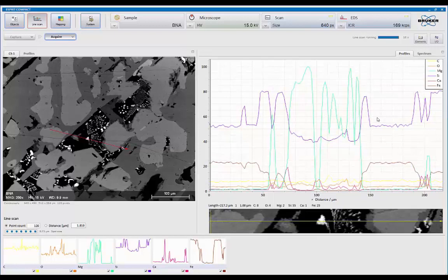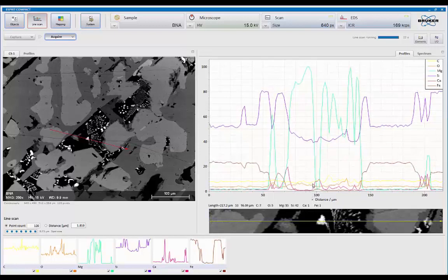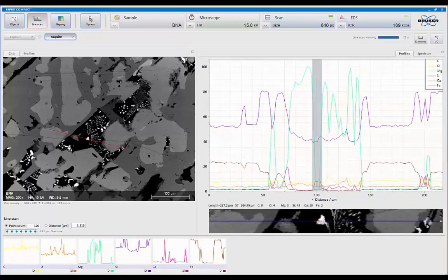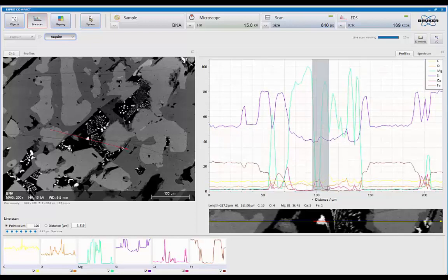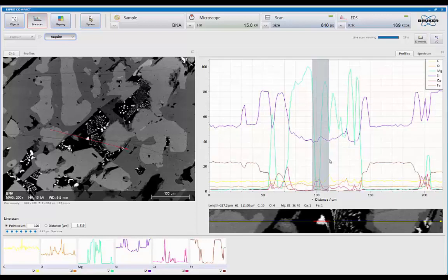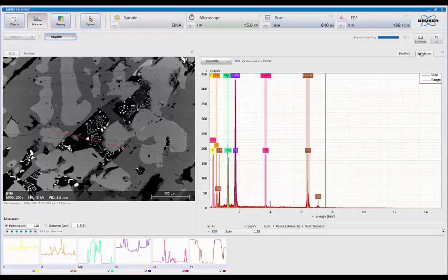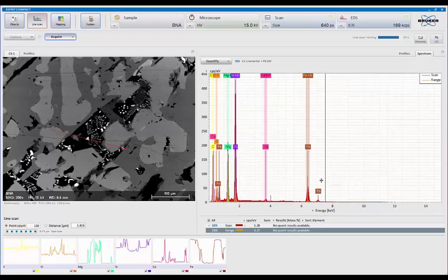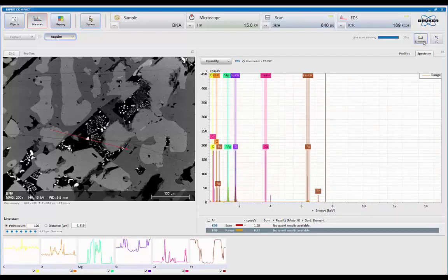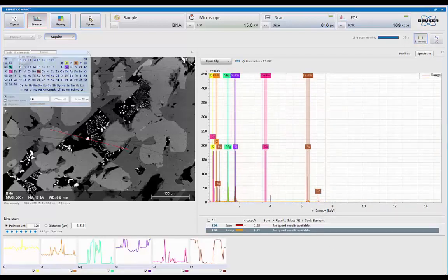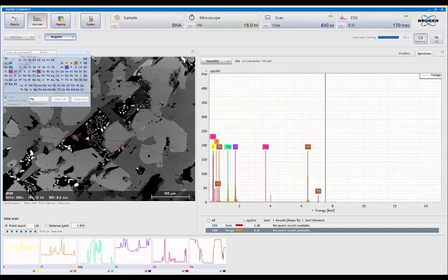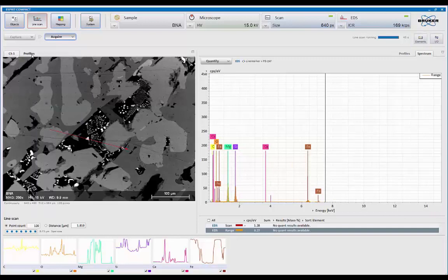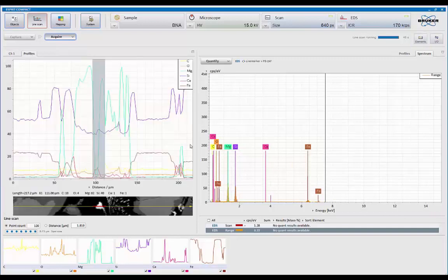The other thing we can do here is I can analyze data. So, for instance, I'd like to know more about this region here. So I can highlight it either on the zoomed-up image or in the profile itself. Click on Spectrum. And now what you're looking at is that spectrum that I just extracted. So again, I'm going to go to the periodic table, turn the regions off. And I'll bring the profile over here.